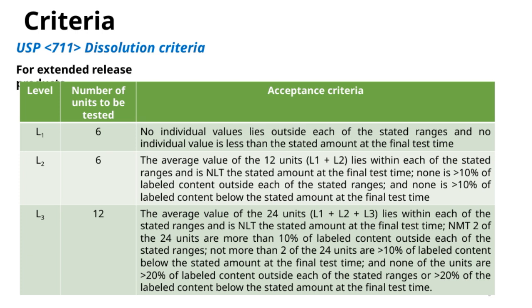This tiered approach ensures a thorough evaluation of dissolution performance, especially for extended-release products. The goal is to balance strict quality standards with realistic variability, ensuring consistent product performance while accommodating some minor deviations.